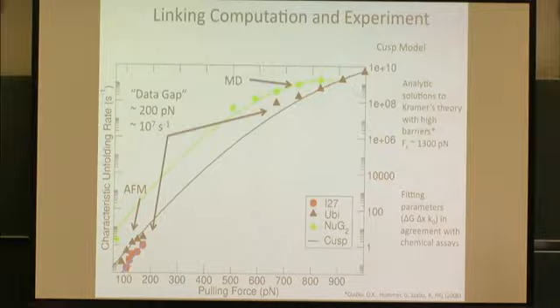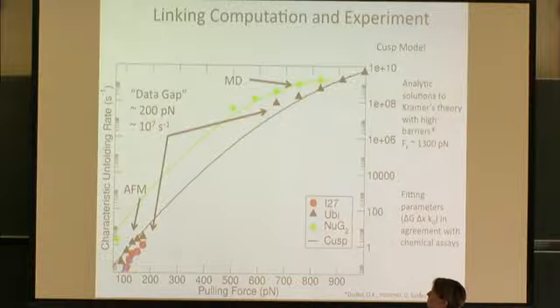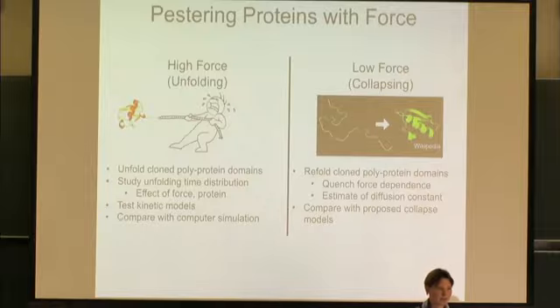and at least then you would get that the fitting parameters, which are extrapolated down to zero force, are somehow compatible with what they measure in biology. So the distance to the transition state is delta x, the free energy without the force, and this is the prefactor k naught. But this is just to tell you there's a lot of room for improvement in this gap and going beyond. So that's the first part of my story. That's all we know about protein unfolding so far.